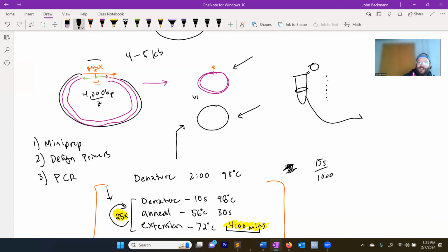So you take this tube and you transform it into E. coli to recover it. But before you do that, you have to do something that selectively gets rid of the wild type plasmid, okay? There's one enzyme a long time ago that I introduced that I said to keep on the back burner. There's a special restriction enzyme. It was DpnI. Does anybody remember what was unique about DpnI? I said, remember this. It's going to come up later.